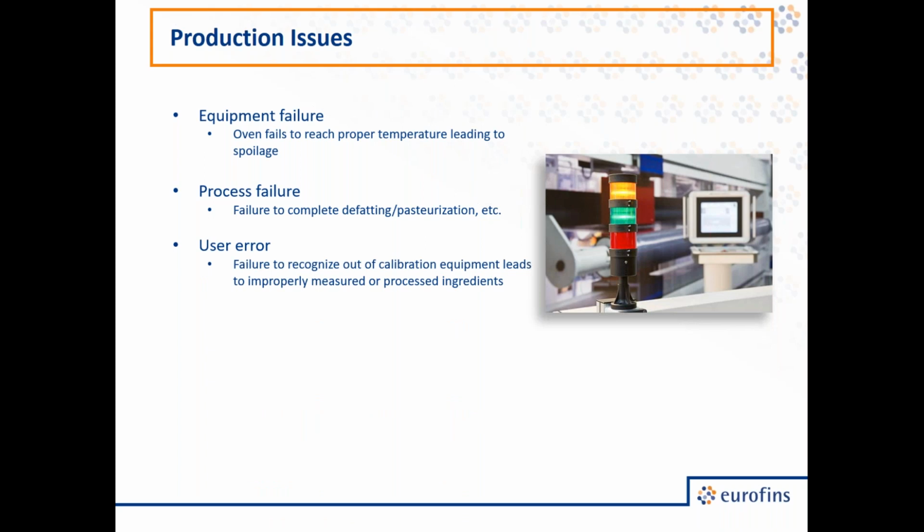Once again, user error comes up, and this would be, for example, failure to recognize an uncalibrated piece of equipment.